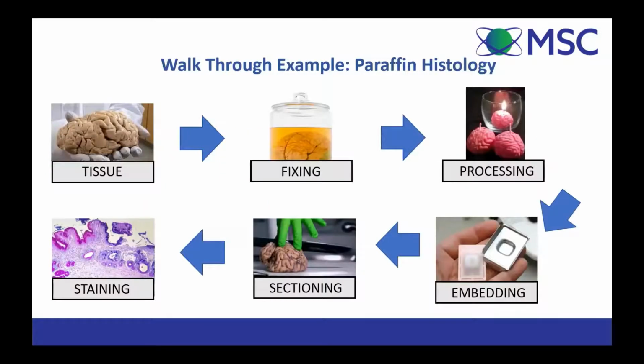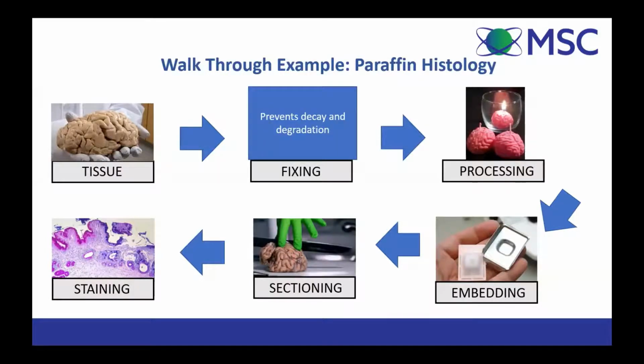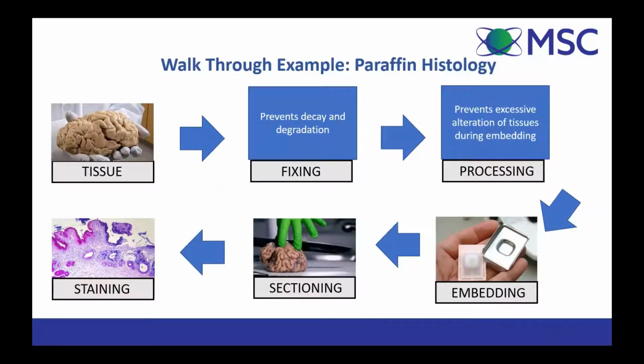It looks again something like this, with a little added step in here. We fix the tissue in order to prevent decay and degradation. We process the tissue in order to prevent excessive alteration of the tissue during the embedding process.